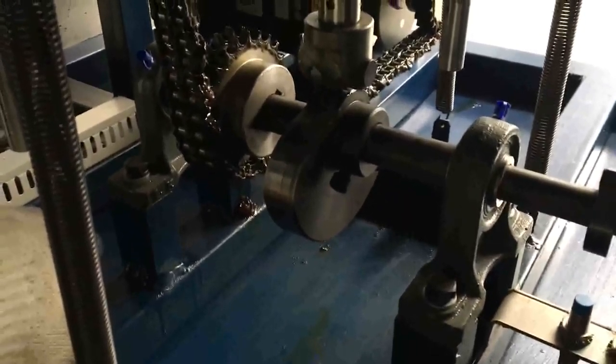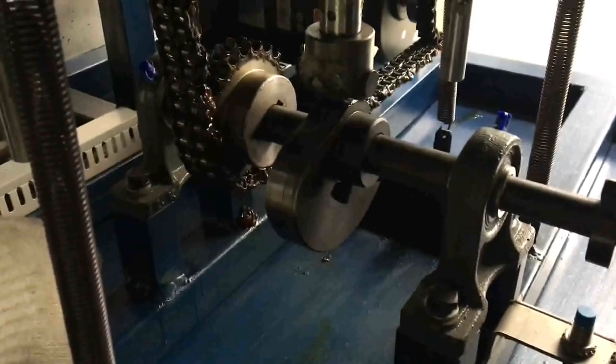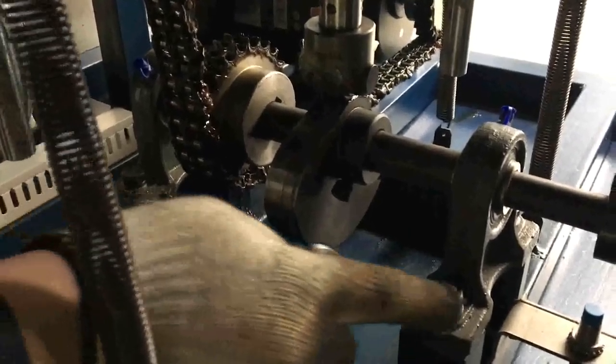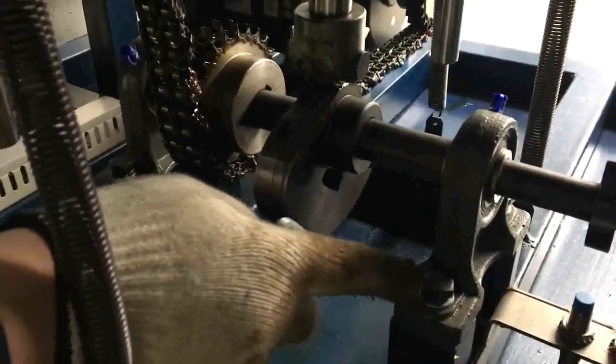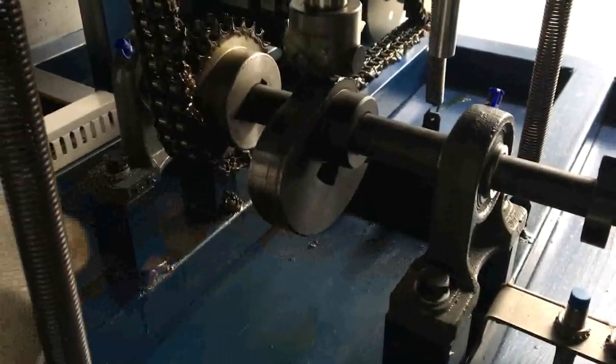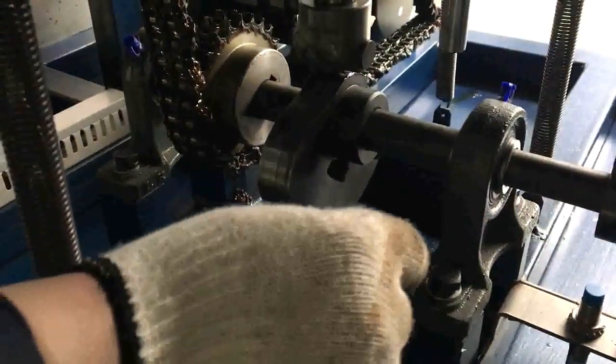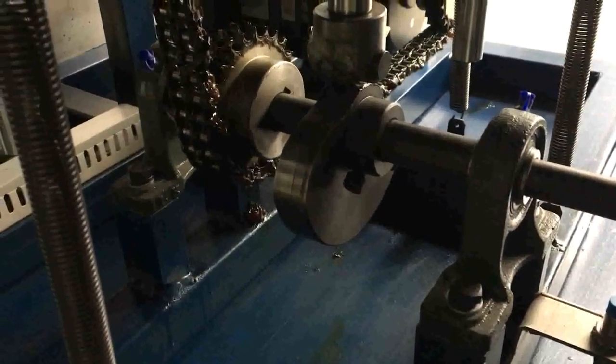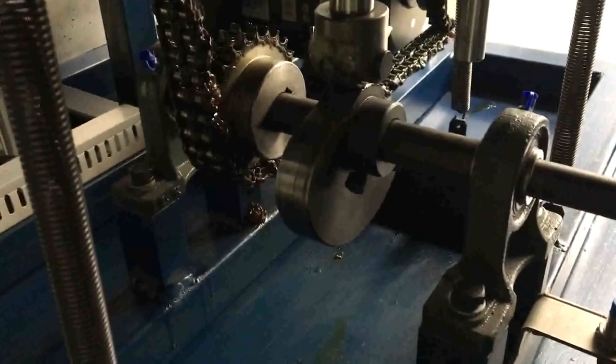If the cam cannot rotate, loosen the whole frame — loosen the screws on the frame and remove the frame to clean the debris in the cam, in order to make sure that the cam can rotate on the shaft.